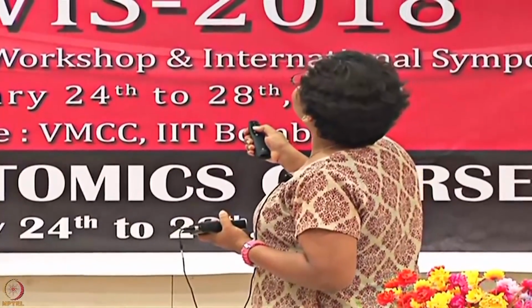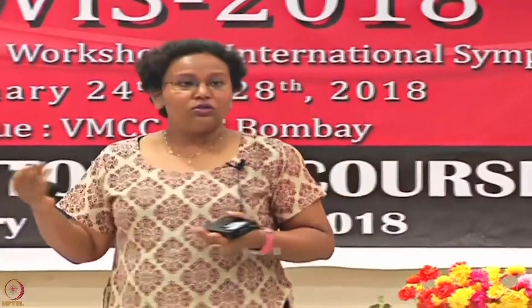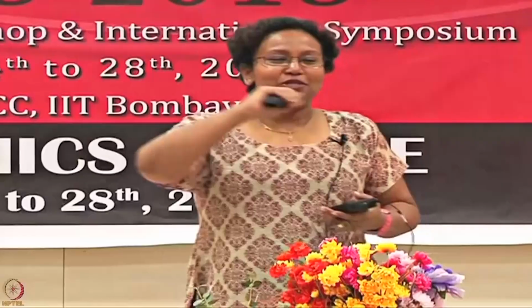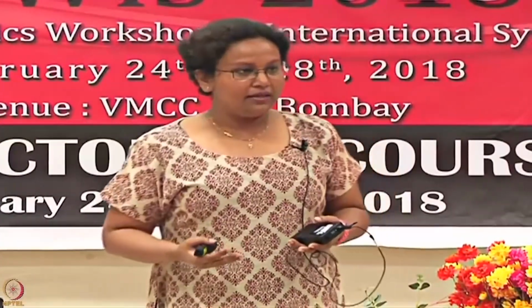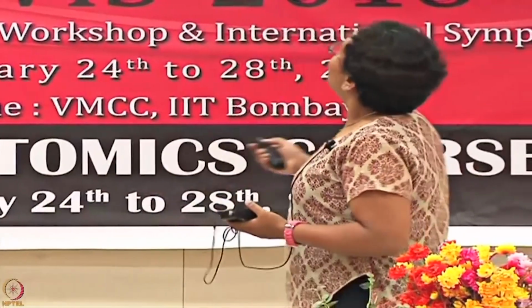In this case you can see that pH 5.5 is the lowest and the highest is pH 4. So what do you think it means? Does that mean that pH 4 is the best for immobilization? Most people think that the lower the pH we go, the more we can attract the protein and eventually we can get the best. Well, there is some amount of truth in that, but not always. If you see here at pH 5.5, which is the highest pH here, you attain quite a large amount of RUs.